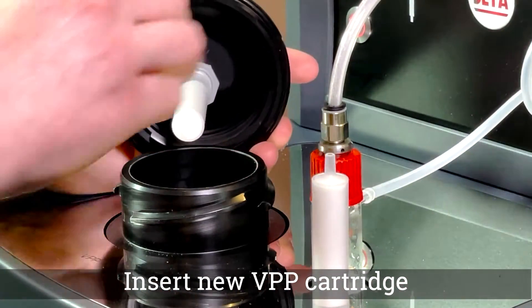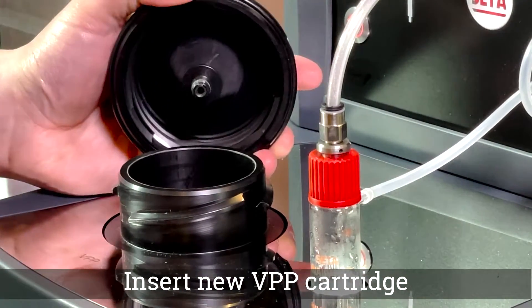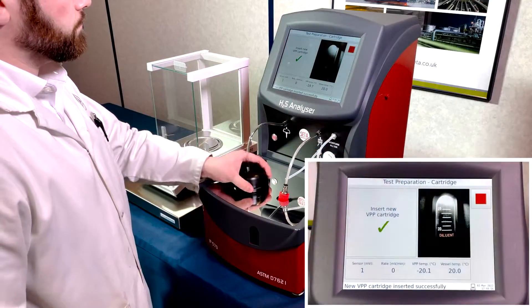When installing a new cartridge, ensure that it is dropped into place and not pushed into the lid. Replace the lid and tighten.